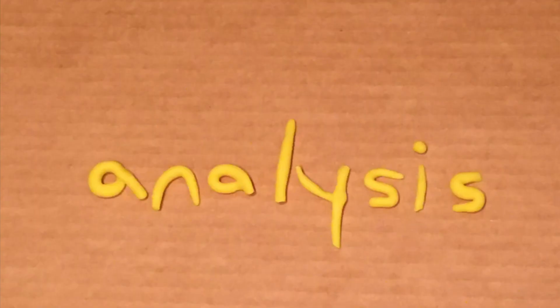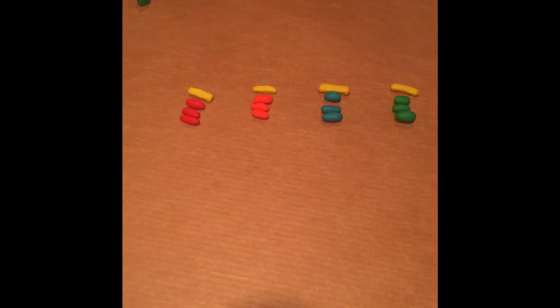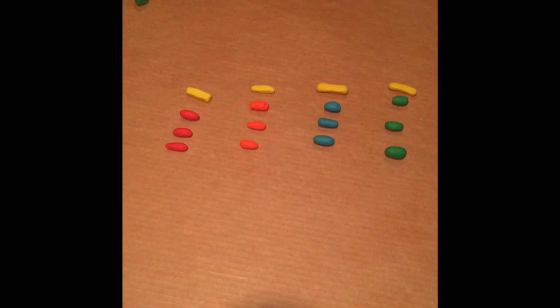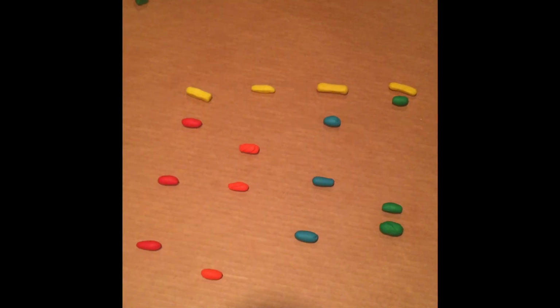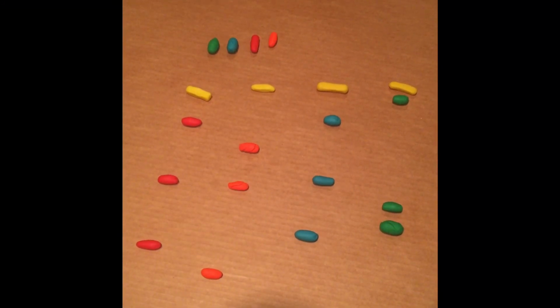In manual sequencing, this process of adding DDNTPs is repeated 3 more times in separate reactions for the cytosine, guanine, and thymine bases. Then, the strands are analyzed via one of 2 ways. If these reactions were all performed separately, a sample is taken of each the A, T, G, and C, and run through gel electrophoresis. Because the electrophoresis separates the DNA by length, looking at the bands from shortest to longest will indicate the DNA sequence.